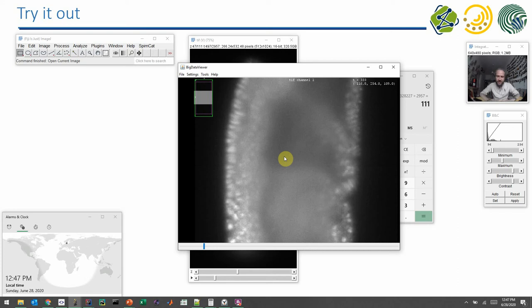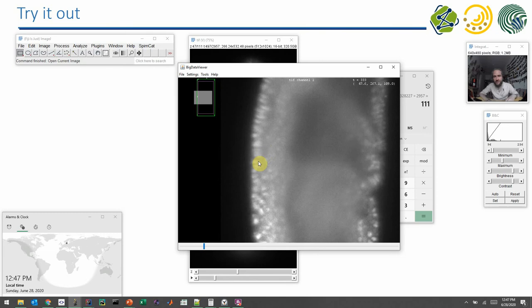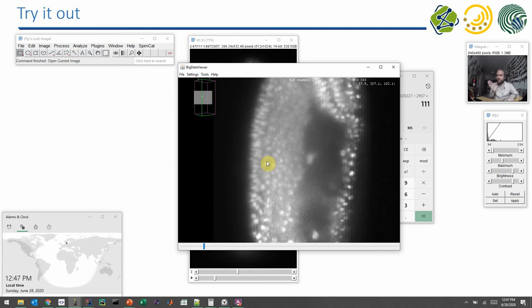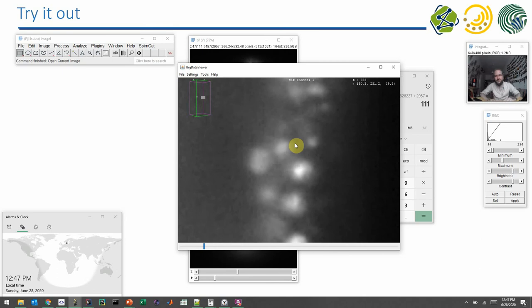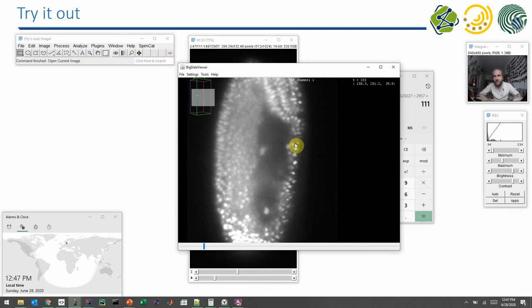Furthermore, you can zoom in with Ctrl-Shift and the mouse wheel. You can, with a right click, pan your dataset. And that's the actual cool thing: you can tilt with the left mouse click. You can tilt it in certain directions. We are now leaving the XY plane. We are going in any random pseudo plane. And zoom in even further. You can see these stripes are actually stripes between different Z planes. By pressing the I key, and turning Interpolation on and off, you can make this effect go away. This is very convenient to look at your embryo, your three-dimensional dataset in arbitrary directions.